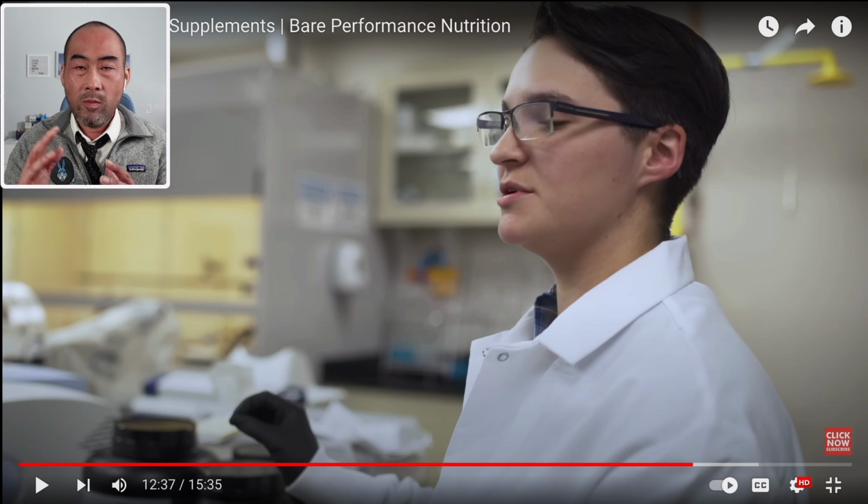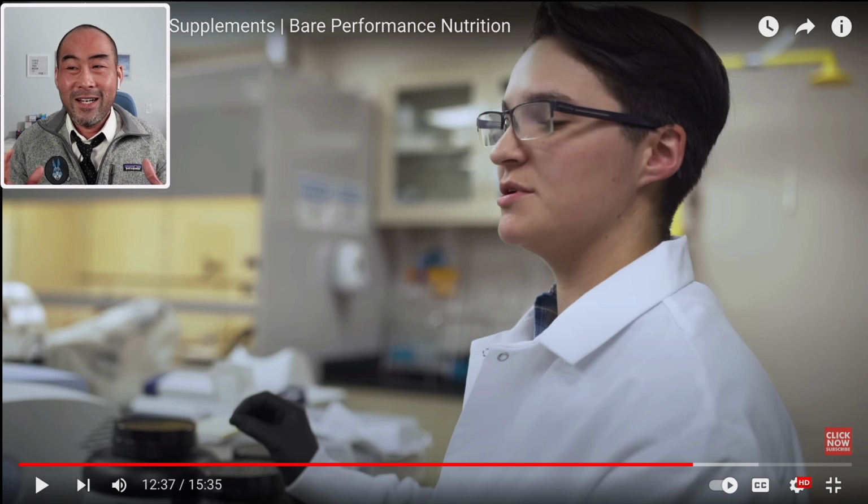So again, this is not the potency testing, this is not contamination testing. Again, I'm not saying that they don't do it. I'm just saying in this context, these fancy words get thrown out, and that's fine. Obviously, they are called what they're called. But I just want you to know that this is all in the scope of identification testing, and this is standard protocol. Essentially, don't fall for it, right? Just know what this is, what it's intended to do, and that's as far as it goes.